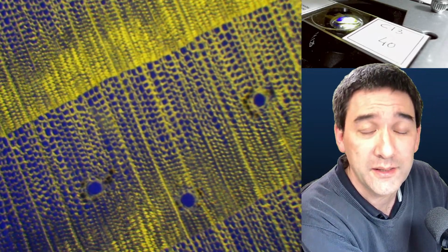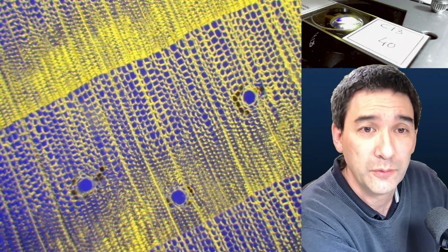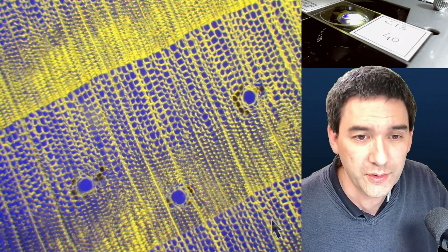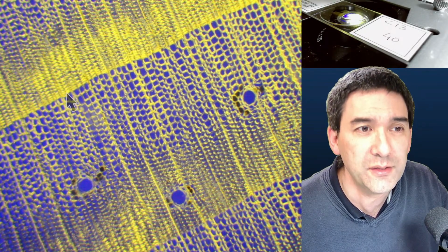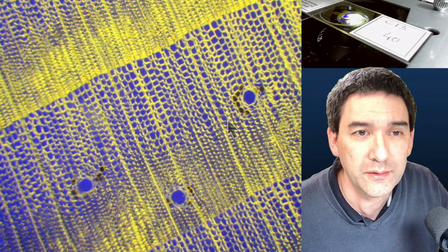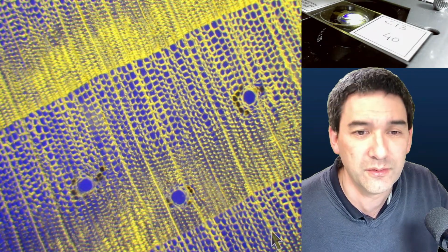And here I like this one a lot. Okay, so let me turn on the blue-yellow filter again. What you're able to see here, now I'm going to switch on the arrow. Do you see those? The cells are dense here. These are the annual rings, so basically the rings of a wood, as they're growing, and these are of course also cells for transporting substances.